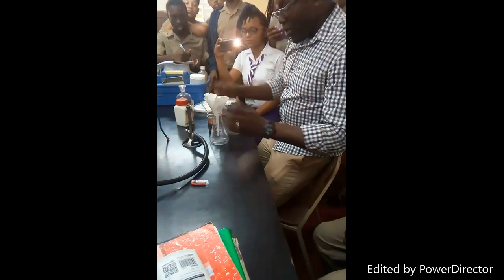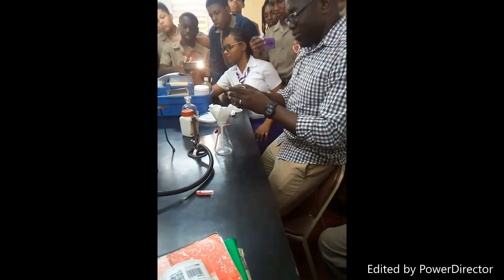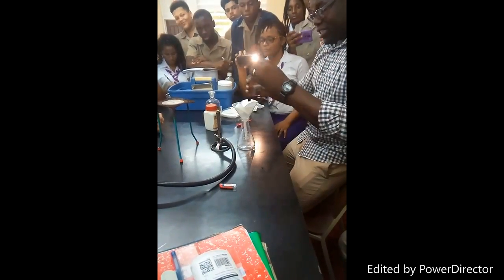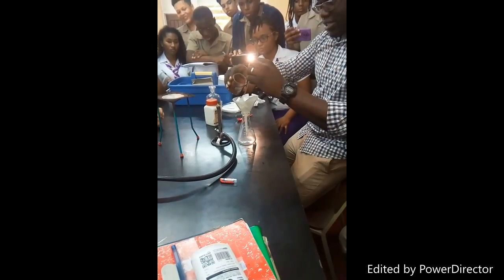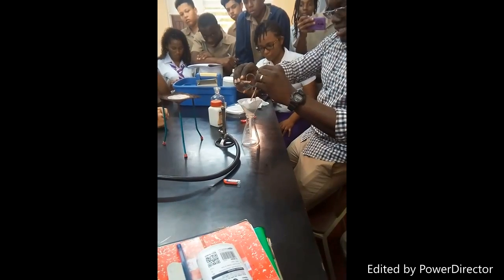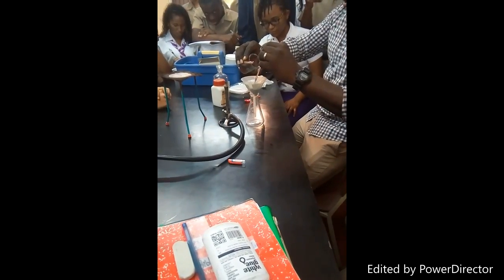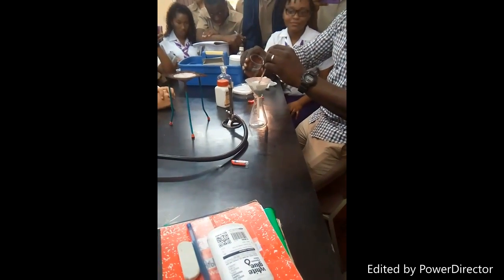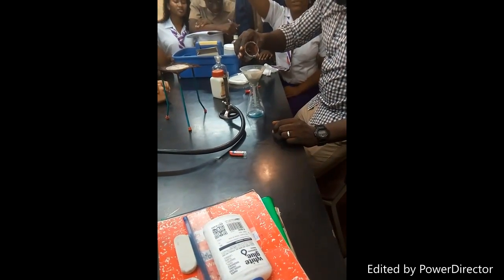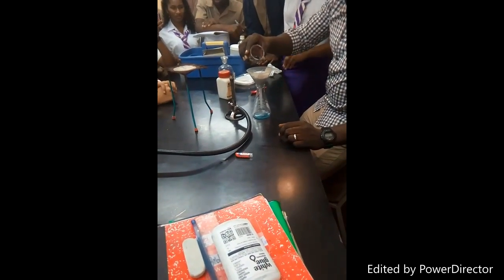Then, having done all of that, we filter. This is not anything exciting. We're filtering the thing now. You're supposed to pour it onto this. Is that blueness? Because we're going to get that special blue substance that we got last time. It has turned blue.